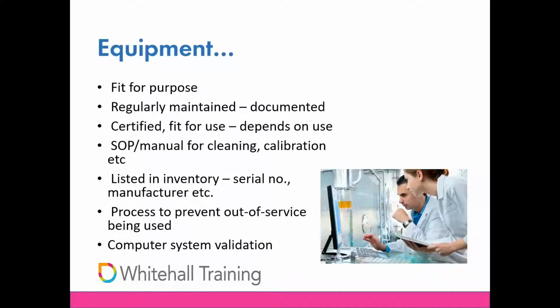Finally, the EMA specifically requires validation of computerized systems. Automated analytical systems are pretty common in GCLP labs, but they do need to be properly and regularly validated.